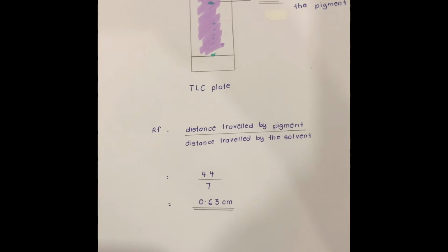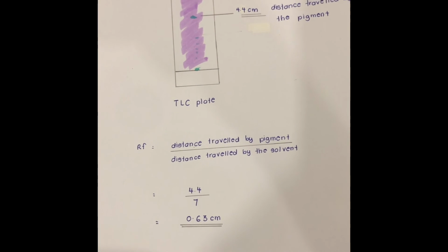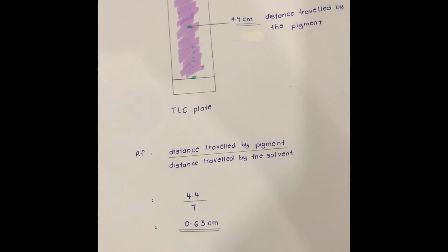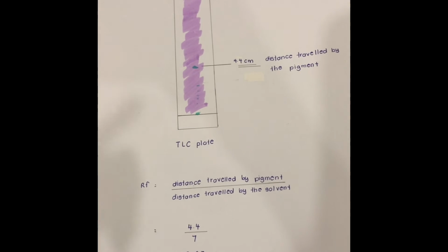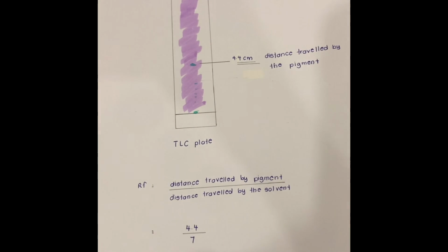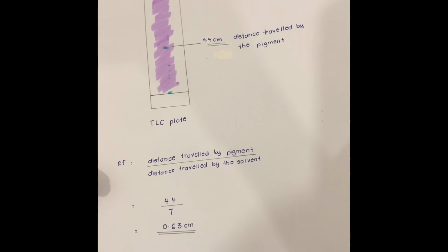So when I look at it, the pigment that I obtained would be the anthocyanins, because the RF value ranges from 0.32 to 0.63. So I got almost the same answer. So the pigment would be anthocyanins.